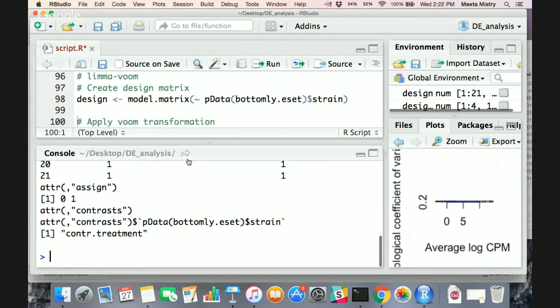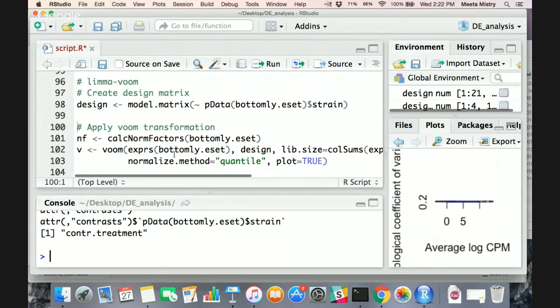So because we're using linear models, I believe, I've always done it the opposite way, where I don't plot the intercept when I'm working with generalized linear models. I'm not sure that it does or doesn't work, so I don't want to give false information. With Limma, you want to do it this way.